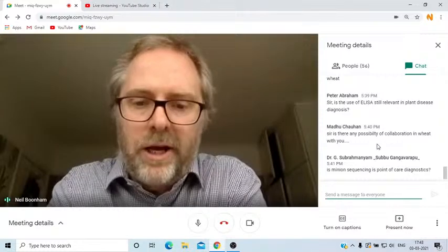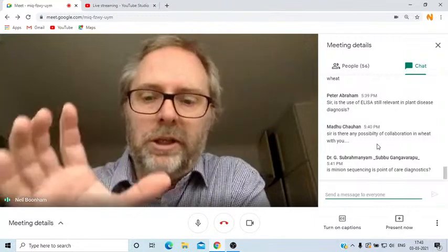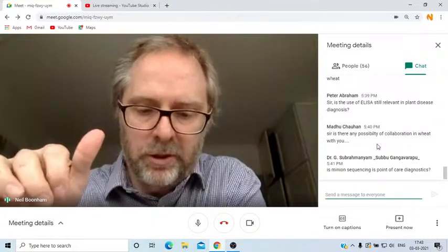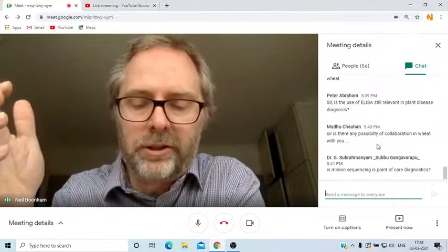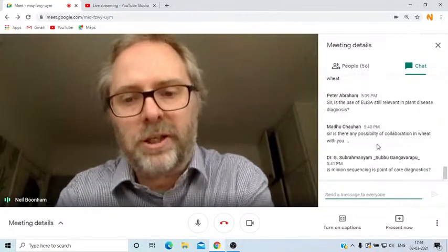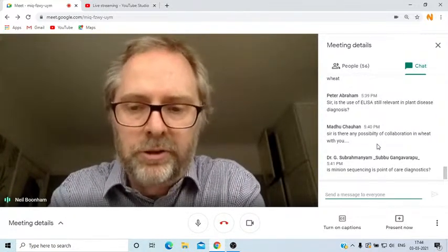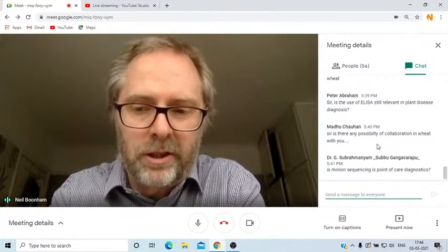I would say not yet. Not yet. So whilst the machine, the sequencer itself, is very small, and as you saw in the picture, you connect it to a laptop, so for sure you can run that almost anywhere where you have internet access. The problem is, you need quite a bit of sample processing before then, and that is really best done in a lab. So you will see there are some papers out there of people doing MinION sequencing in the field. But I think routinely, it's not really a point of care diagnostic yet. But hopefully it will be in the near future.